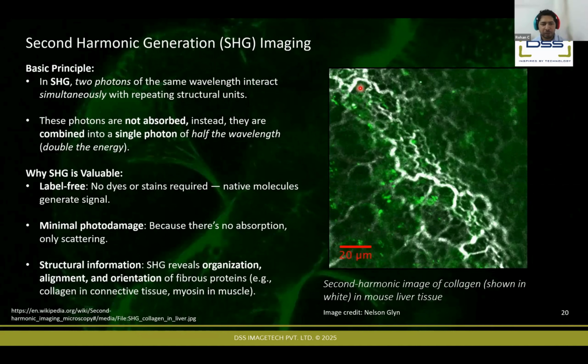So that's a very good question, actually. The real strength of this second harmonic generation imaging is that, like you mentioned, you have to differentiate between laminin and other kinds of extracellular matrix components with deep tissue imaging. Apart from collagen, microtubules, and myosin, there are not many other tissues that you can directly visualize with second harmonic generation.